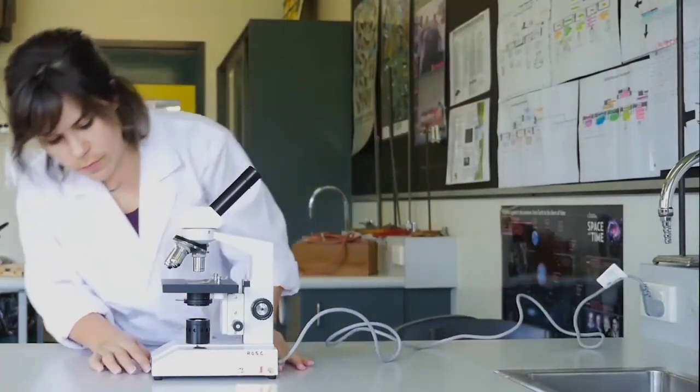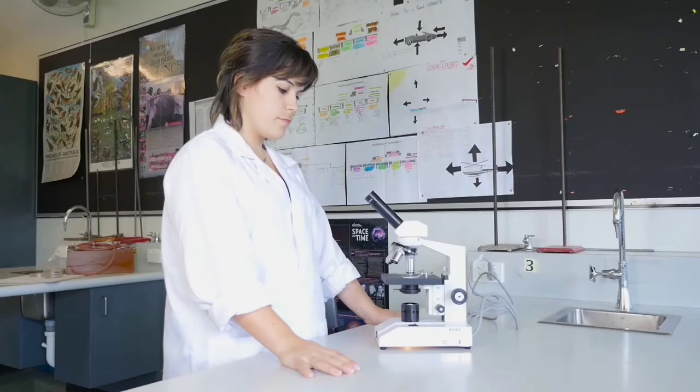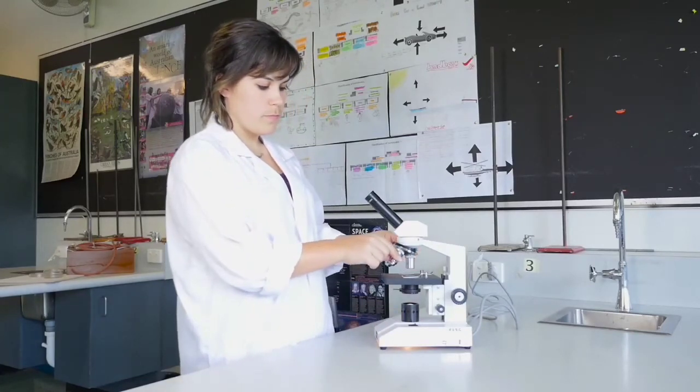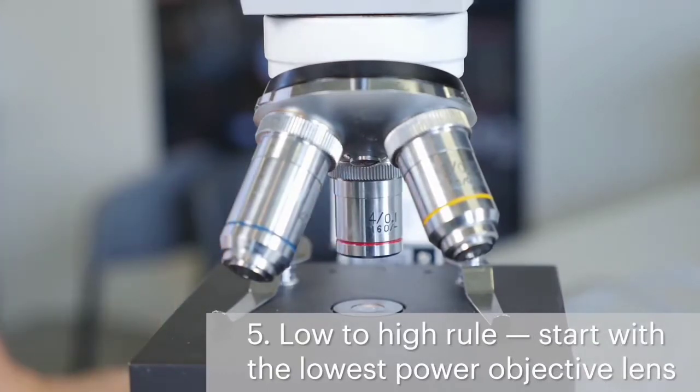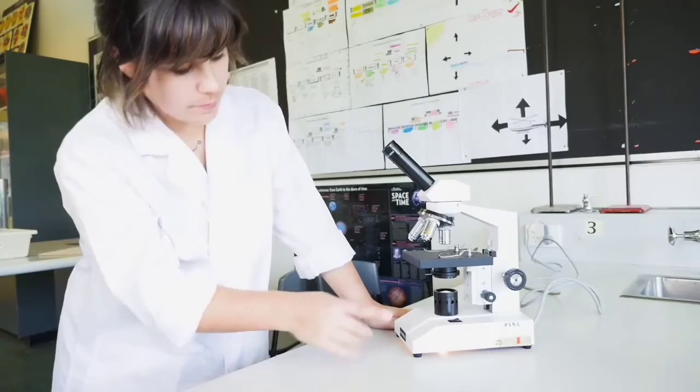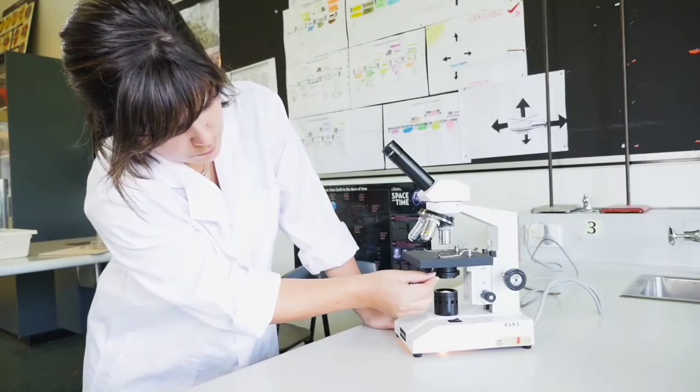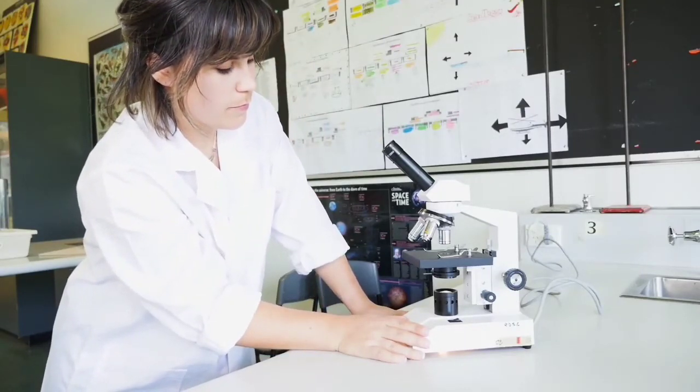Unwind the cord and plug the microscope into the power point. Find the on-off switch. It's usually at the back or side of the base. Every time you use the microscope, always follow the low to high rule. Start by selecting the lowest power objective lens and later zoom in by working your way up. The lowest power objective lens is the smallest objective lens and is usually marked with a four. Here's the diaphragm. Opening it lets more light in and closing it will make the image darker. Use the lever to adjust it so that a medium amount of light passes through the hole in the stage. You can readjust the light later to improve the image. Remember the brightest light doesn't necessarily give the best image.